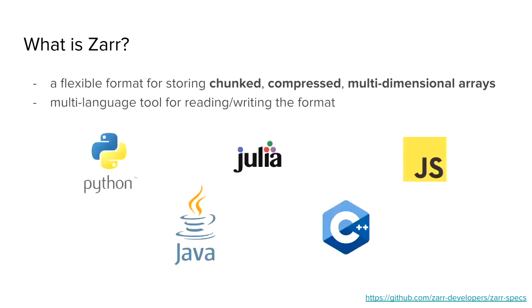And a very important aspect of Zarr is that it describes a flexible format, and then many different languages implement libraries for reading and writing that format. And so I've just displayed some of those languages here. I'm the lead maintainer on the JavaScript implementation, but it's a very wide community. And there's also a committee voting on new features to add to the specification. And there's a lot of buy-in now from a much wider community than just the bioimaging community.